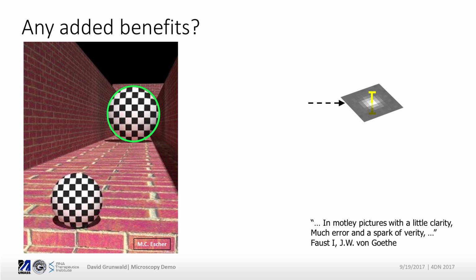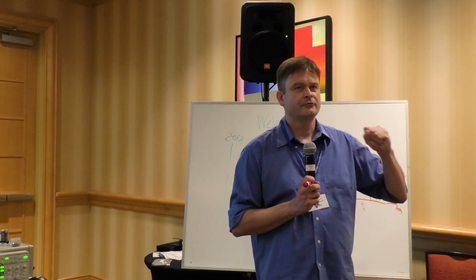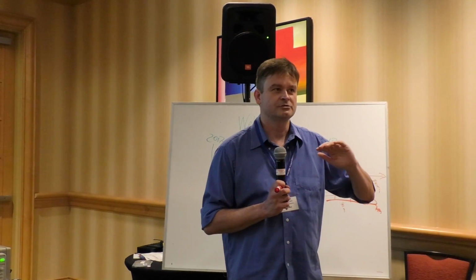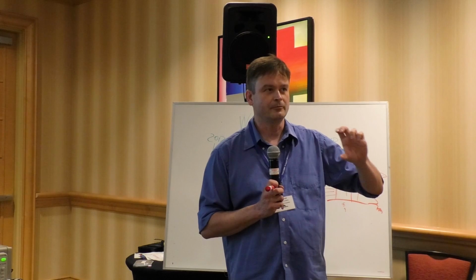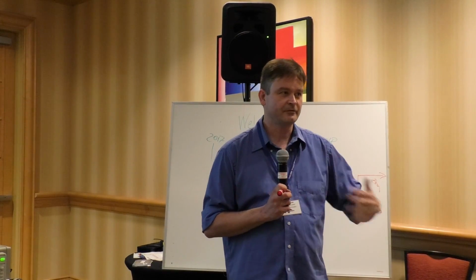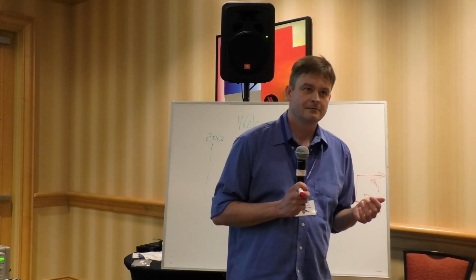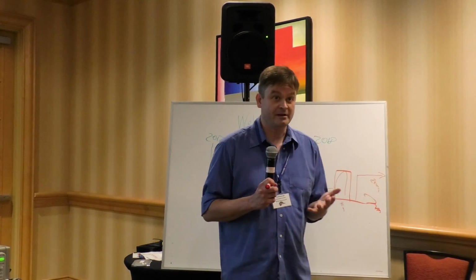And what I think is a vision of, wouldn't it be nice if my single molecule FISH data would generally come with something like, they have 2 sigma reliability and a better than 90% detection efficiency, or we're more than 90% certain that this is a signal, and then we take it. And that's the signals we count in an image. Does anybody have such data on their single molecule FISH? Right, we don't. But it would be nice, right?